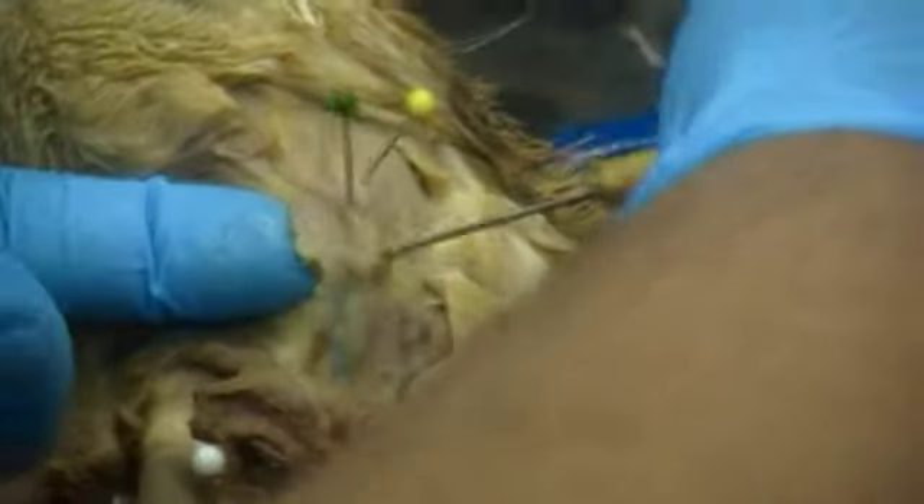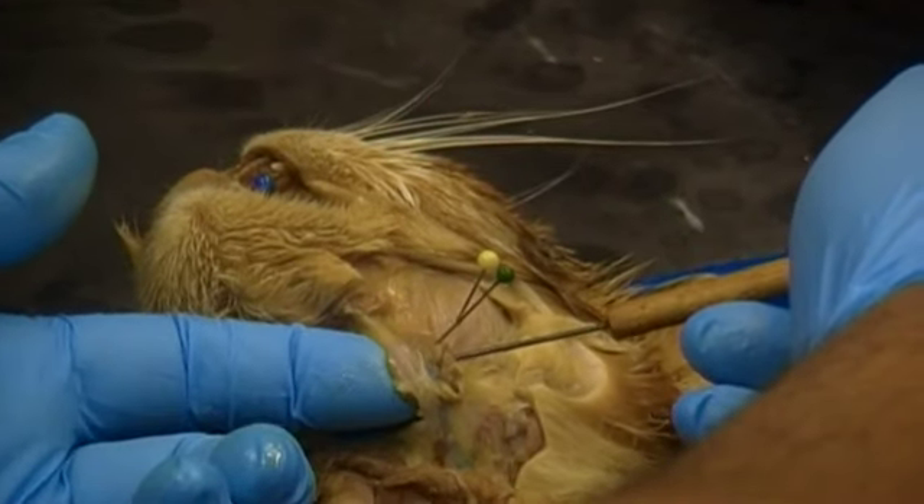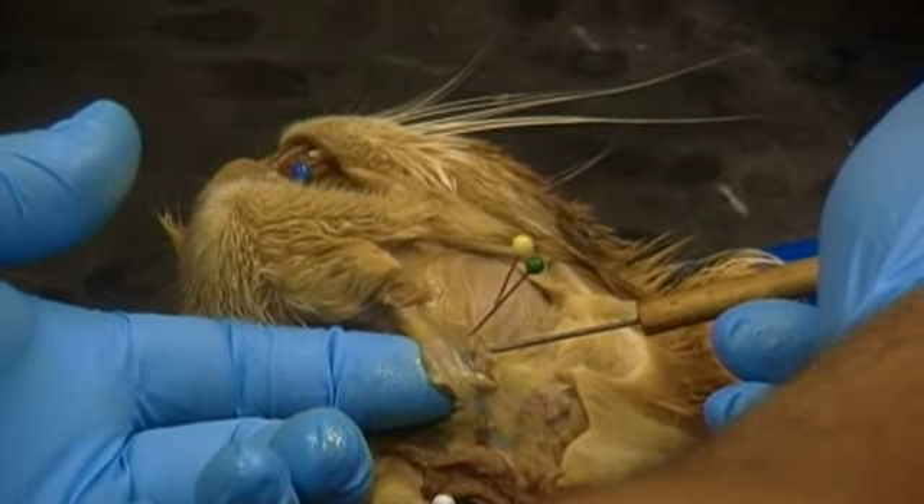Just below that is this glandular structure right here. We have this glandular structure, and we have the jugular running in between it. This glandular structure, labeled by the green pin, is the submandibular gland.